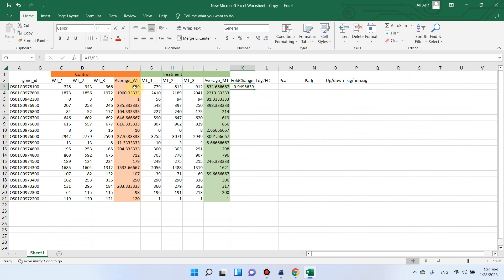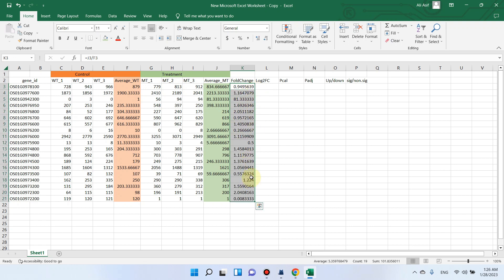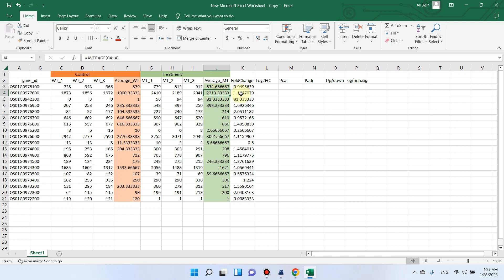It shows that because this value is less than one, this gene is slightly down regulated. We can double-click on the dot and it will show us the FC value for all genes. Here we can see one value is greater than one — this gene is a little up regulated — and this gene is 81 times up regulated in the mutant type. And here this gene shows only 0.2, meaning this gene is down regulated.